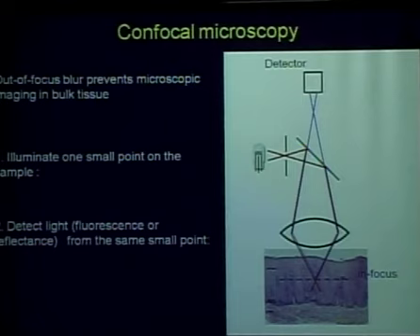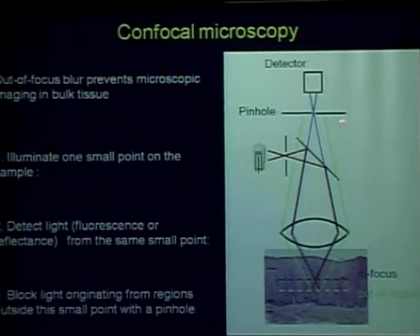confocal microscopy as a way of basically gating out the defocused photon. So if we place a pinhole at a conjugate image plane in our confocal microscope, light that's coming from our focal plane will pass right through the pinhole, whereas the out of focus light below and above this plane are mostly rejected by the placement of the confocal pinhole.